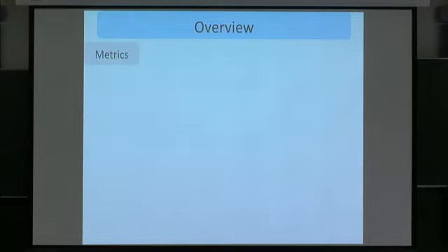Okay, review of the metrics that we're going to be using. There's a few different metrics, and I know that there's definitely room for more of them to be added in. But for this notation, I'm going to let X star be our predicted bacterial frequencies of a particular taxonomic rank R, and X_R be the actual ground truth.